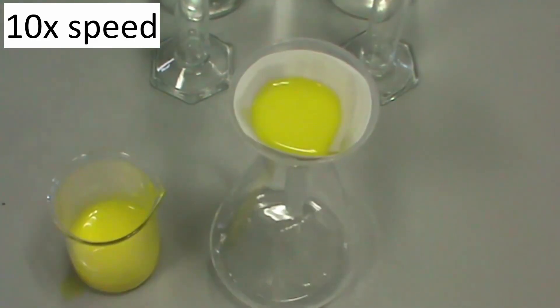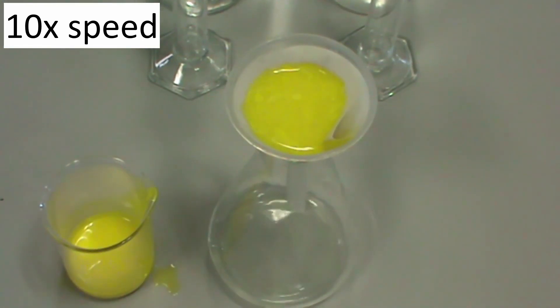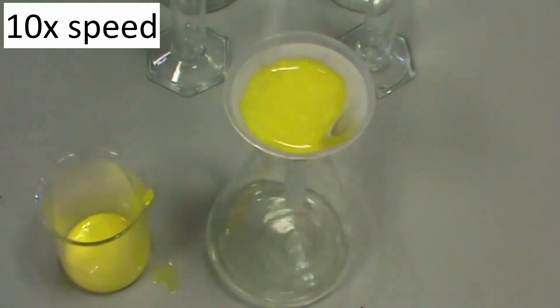To extract the lead iodide precipitate from the mixture, set up a conical flask with a filter funnel and a piece of folded filter paper. Slowly pour your mixture into the filter paper and leave for several minutes to filter.